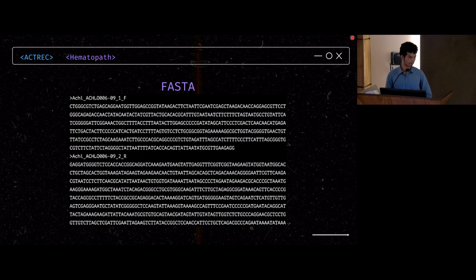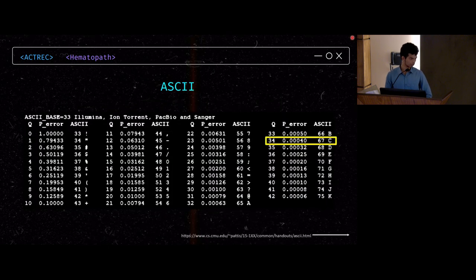How do we determine the quality for each base? The sequencer itself determines it and gives us the quality. It has these algorithms built into it. How exactly it does that, I don't know, but these are built into the base calling, which already happens on board. You have to blindly believe that. Everything is maths and probability.